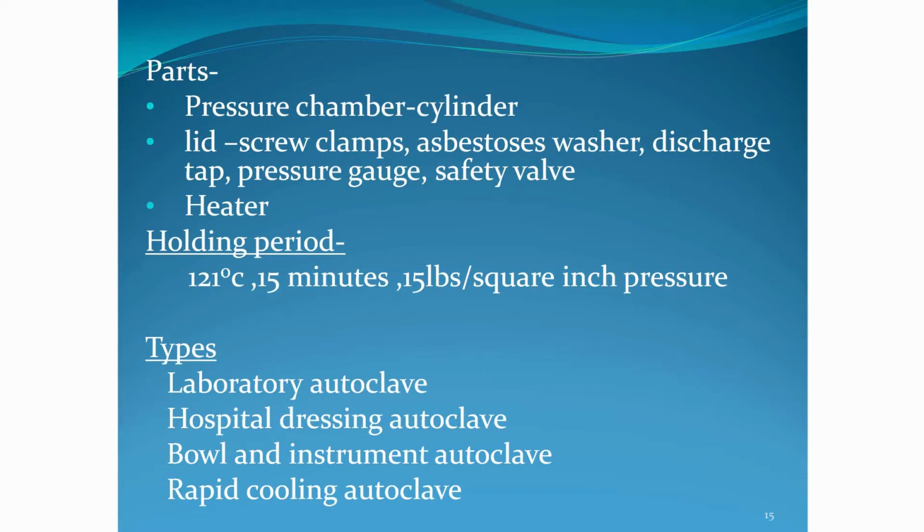It has parts like a pressure chamber or a cylinder. There is a lid with screw clamps, an asbestos washer and a discharge tap with a pressure gauge and a safety valve, and there is a heater.